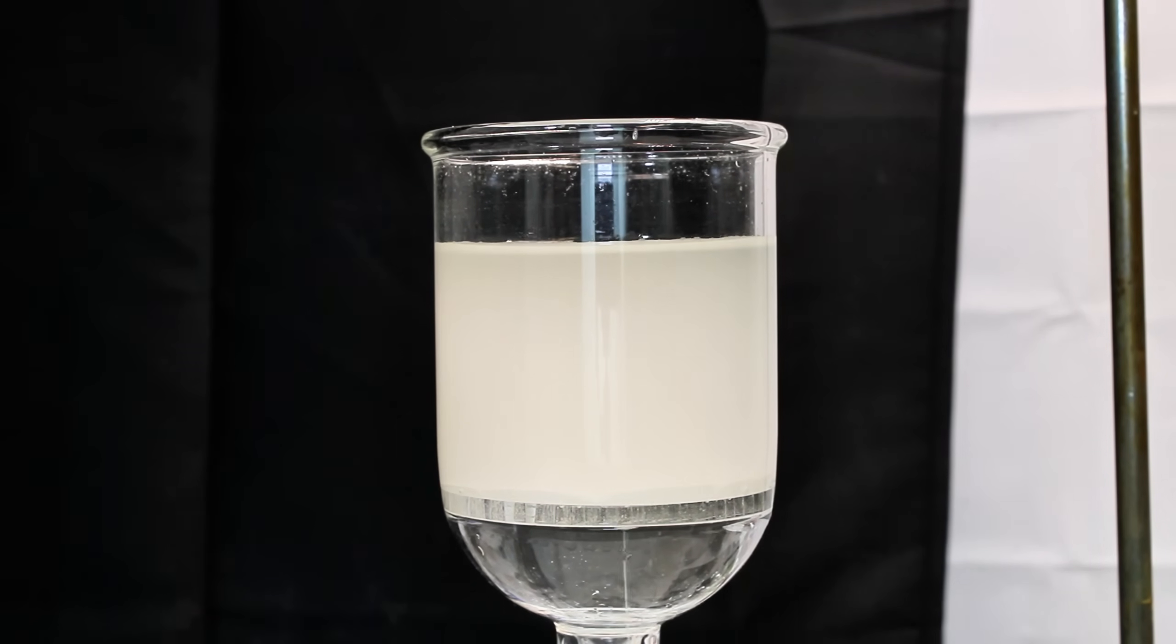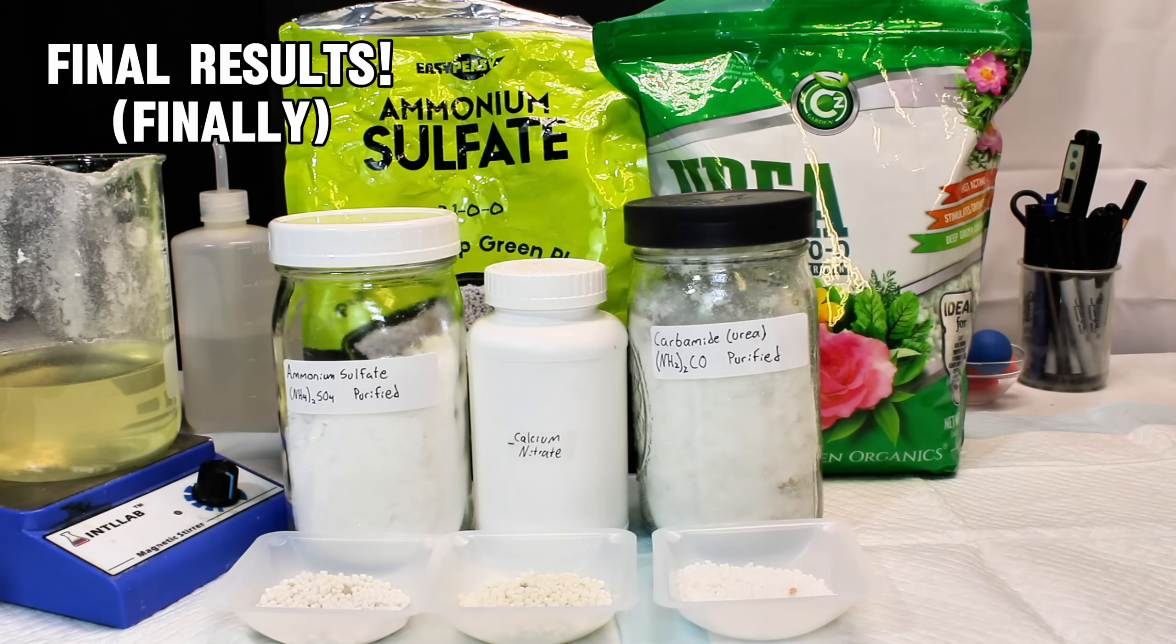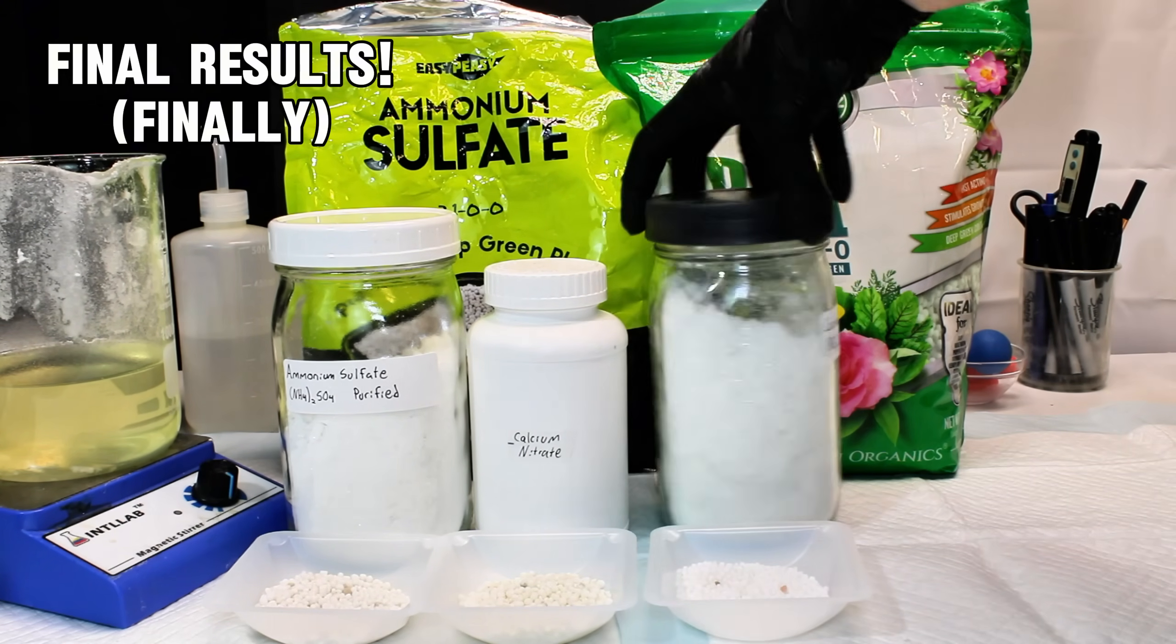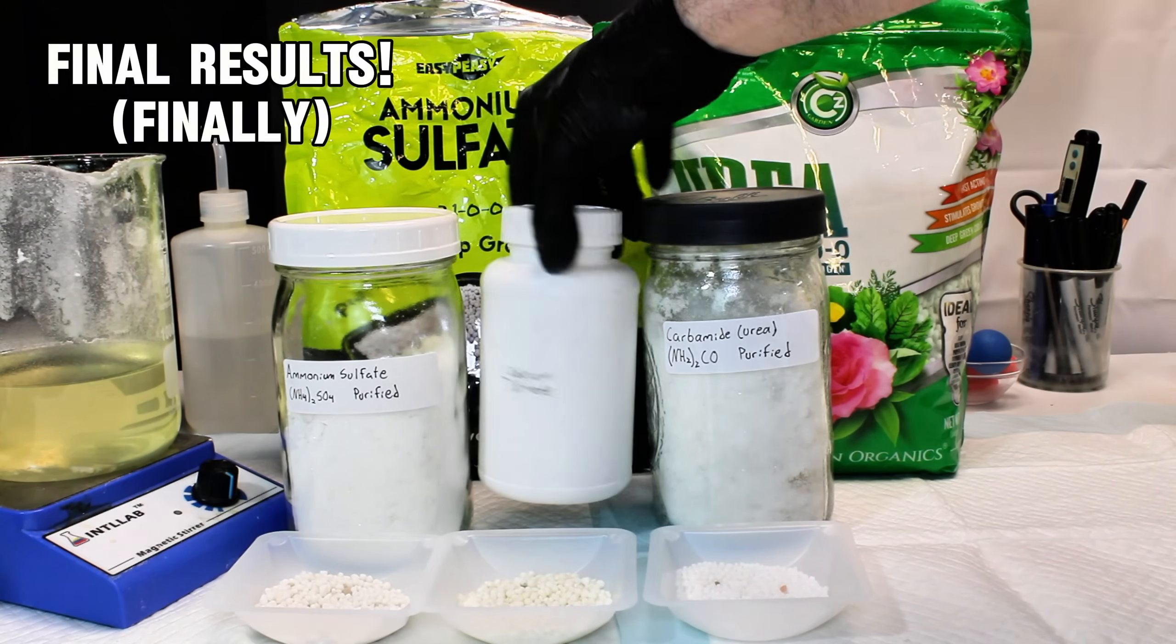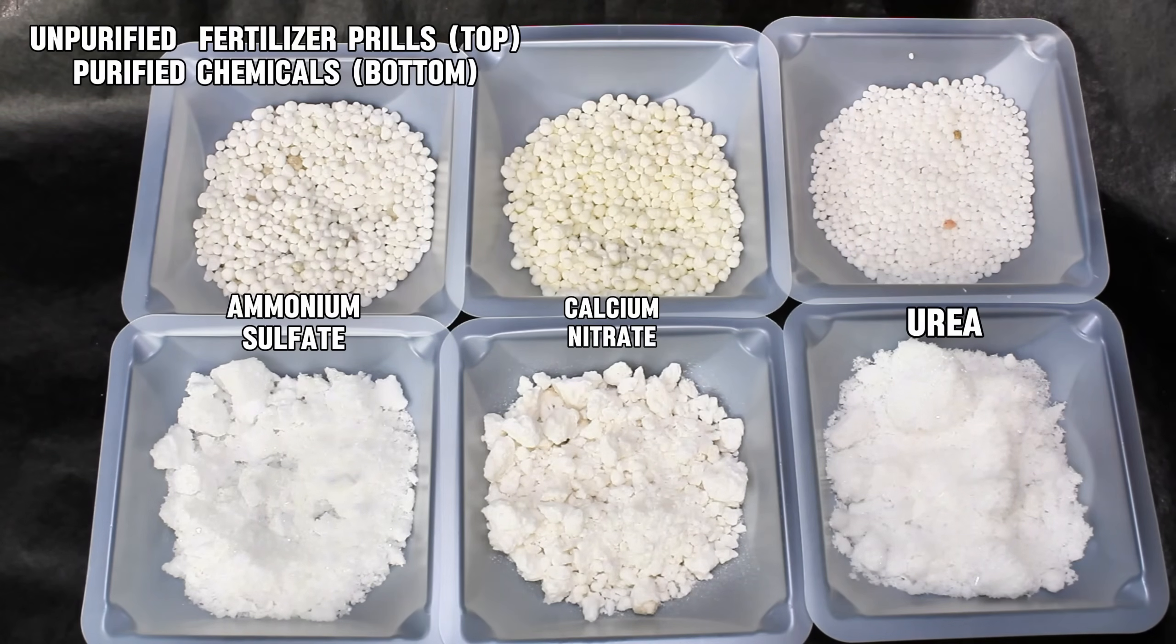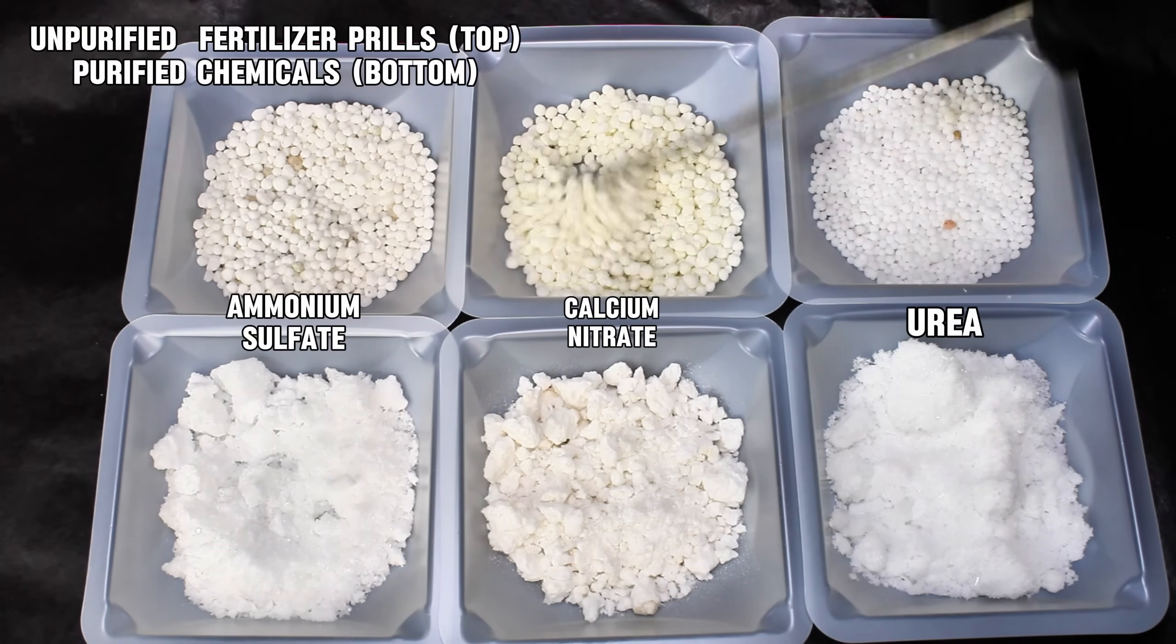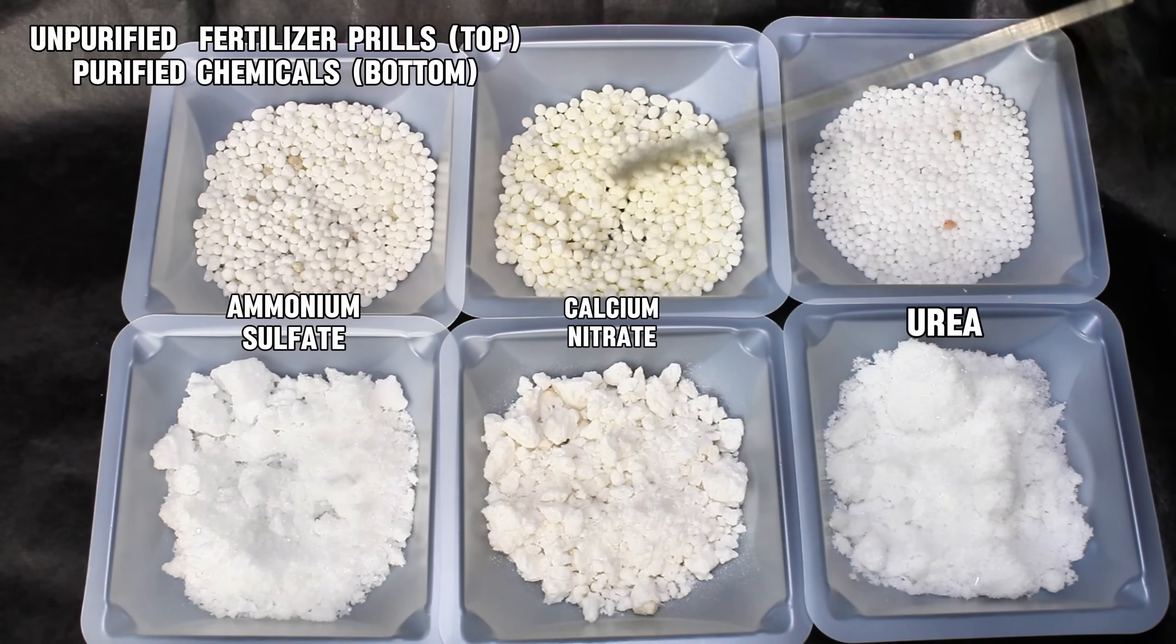This process was repeated a couple more times over the course of the next few weeks until I was left with a mostly pure ammonium sulfate. Now after more than a month from starting this project, here is some of what I collected, and here you can see the initial unpurified fertilizers alongside the purified versions below. I plan on using all of these in a variety of future videos given the broad usefulness of these salts.